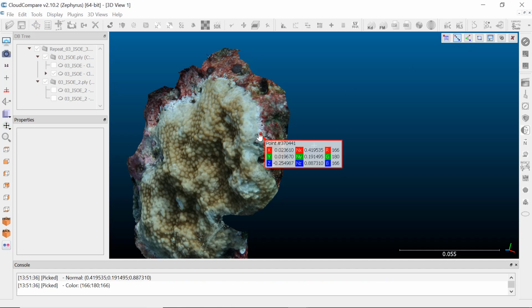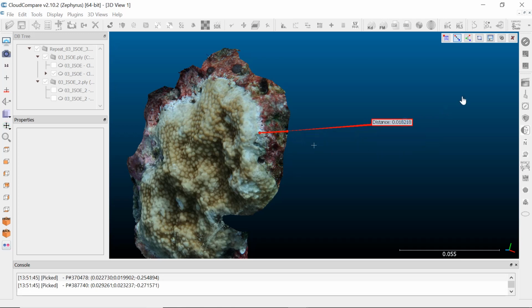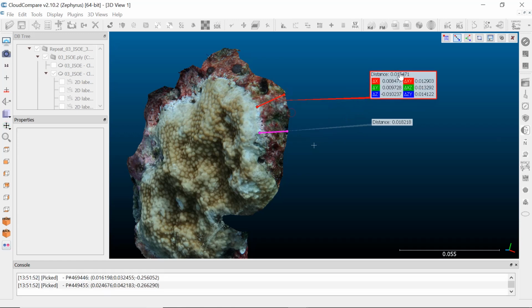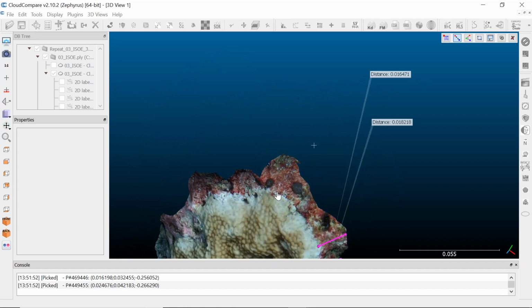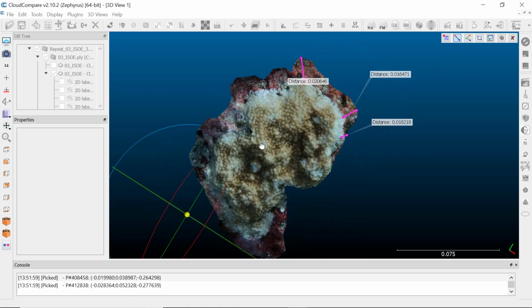And then I can, this was not exact, mark the outline of the older model and then the outline of the model which represents the more recent one. Again, you have to click save after each one. And you do this at least 10 times around the coral colony. As you can see, the growth can also be quite irregular.